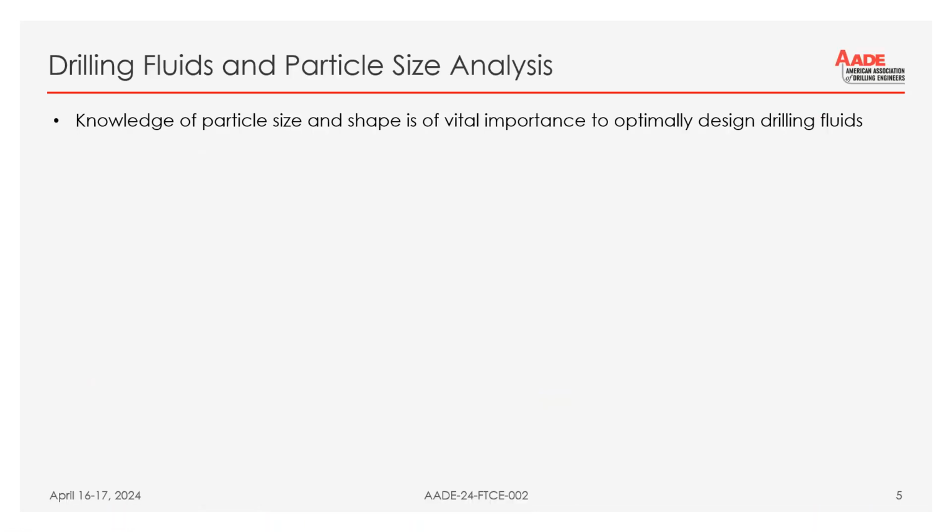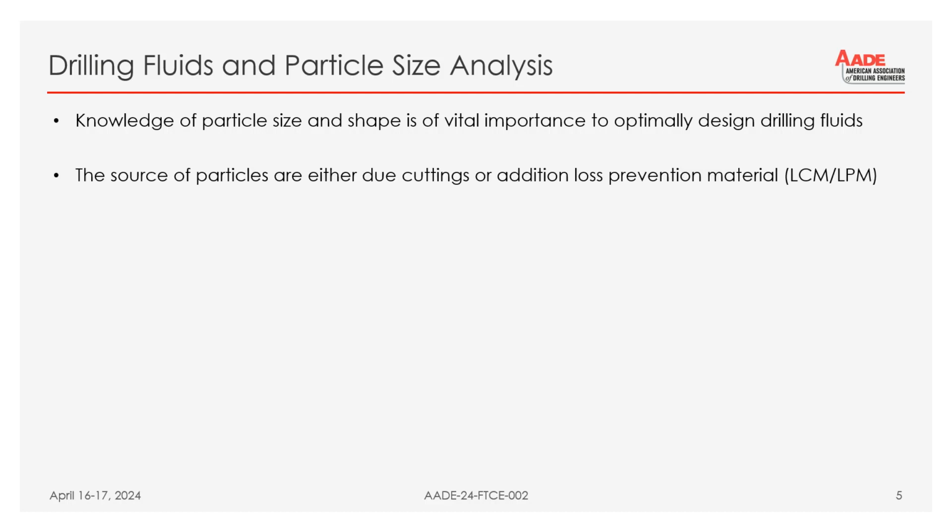So, when it comes to drilling fluid, I think everybody realizes that particle size is very important. Particle size is a key measurement for a lot of the drilling fluids, both before, when you have clean base mud, or when you are evaluating recycling and looking at the cuttings and whatever's left in your sample.